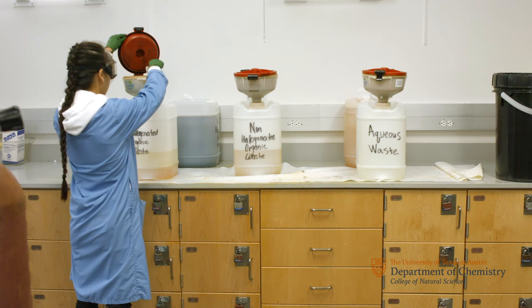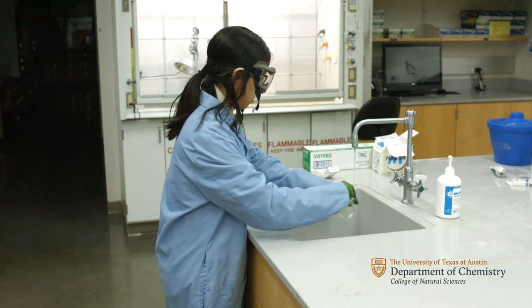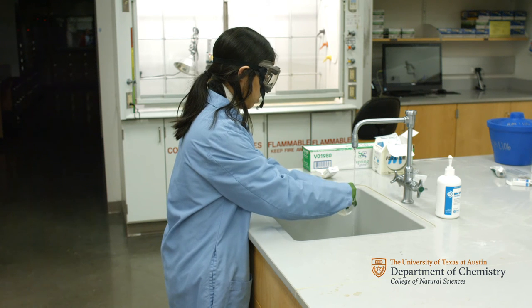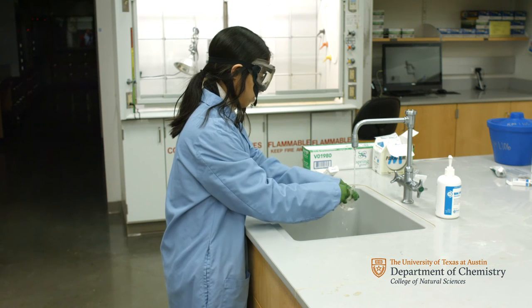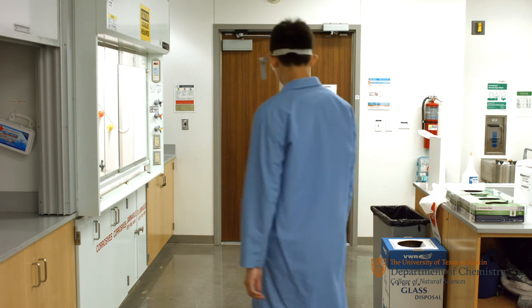To clean up, dispose of any liquid waste into the proper waste container. Wash all your glassware and then put everything away. Finally, return the lab coat to the rack and the goggles to the UV cabinet.